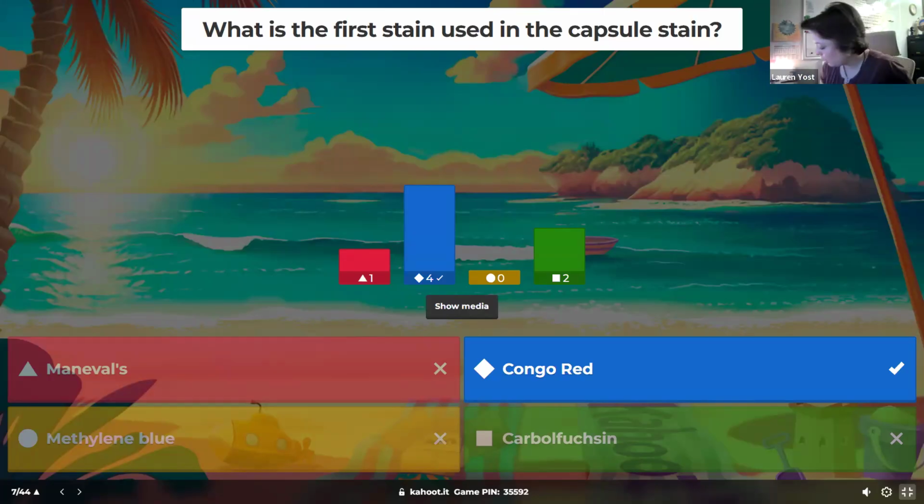Fourth was endospore. Positive endospore. Don't just put green. Don't just put green. Okay, so in a positive endospore stain, you will have what we could call organized structures that will stain green inside.